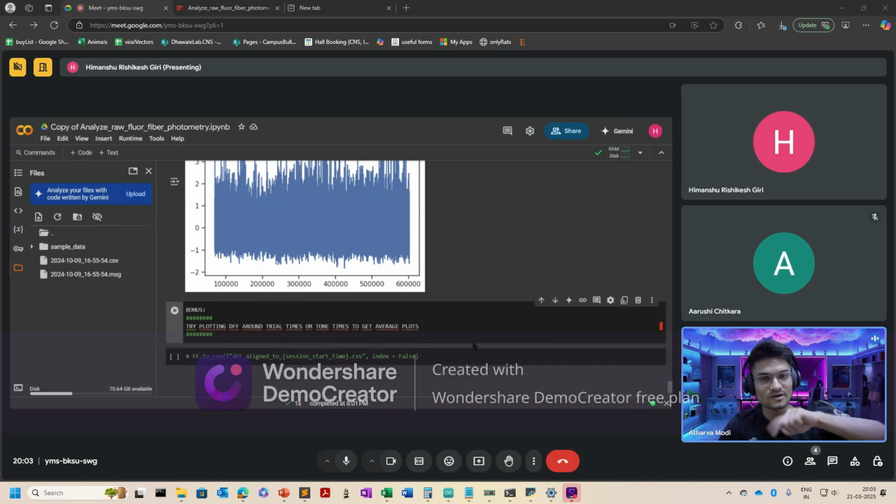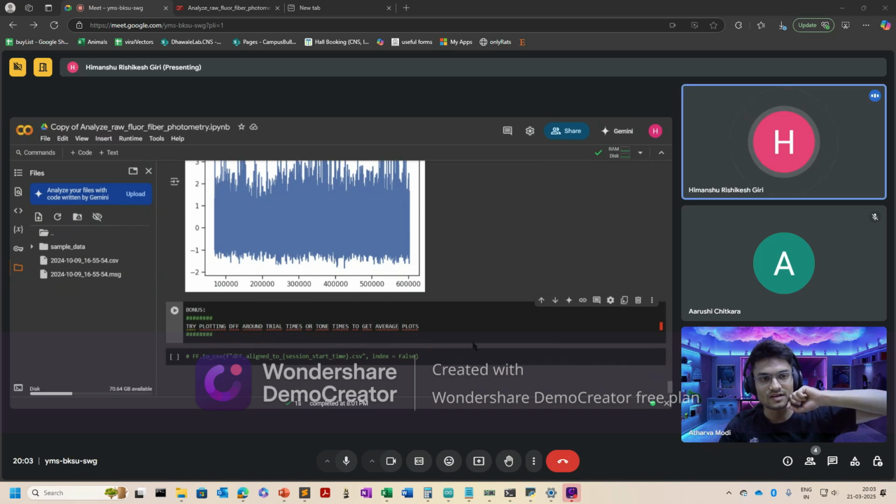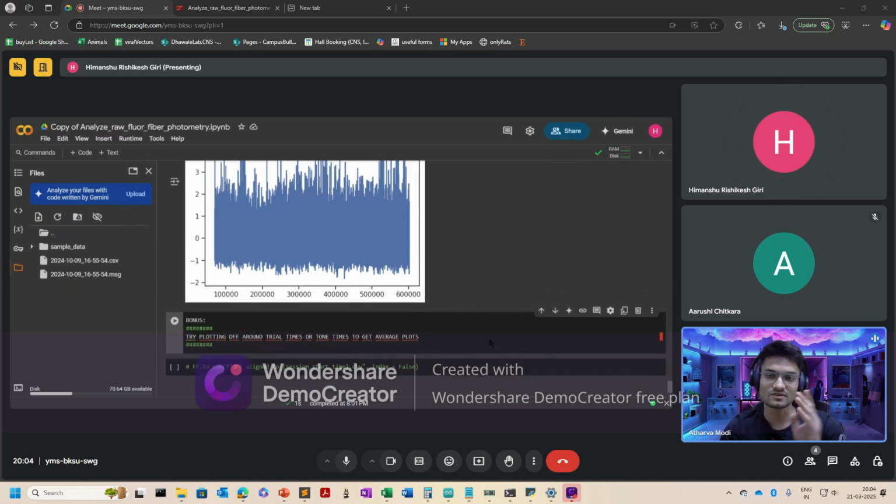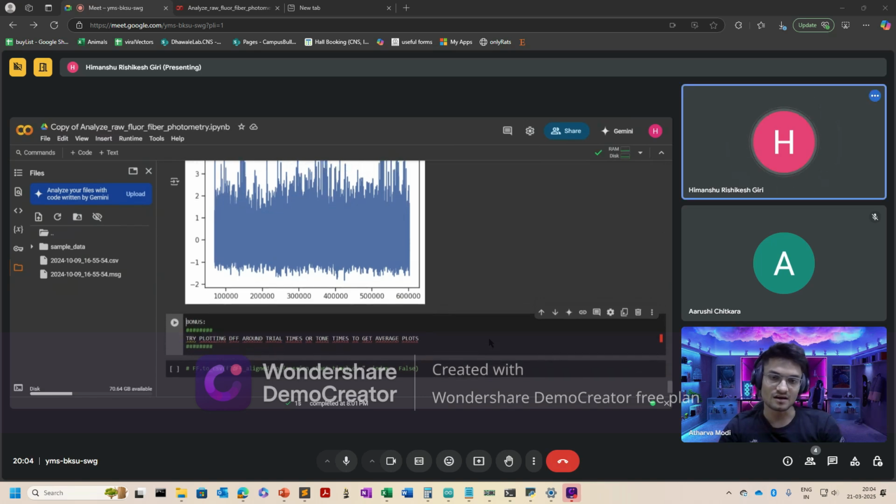So that's it. This bonus section, you can try by yourself. Just ask the AI to do that for you: collect the readings from minus 500 to 500 for different trials and different tone times and present it. Something like that you can do. And yeah, this will be it for today.